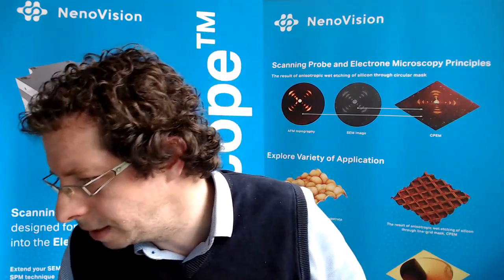PFQNM mode, I'm not sure. Maybe it's the PeakForce from Bruker. So currently, no, we don't have such a mode. I think it's protected by patent anyway.